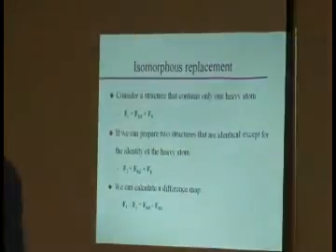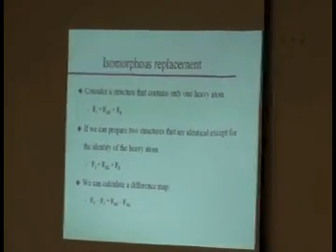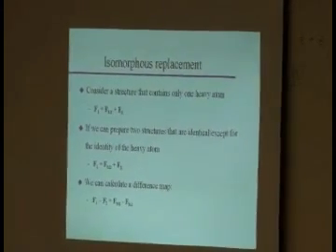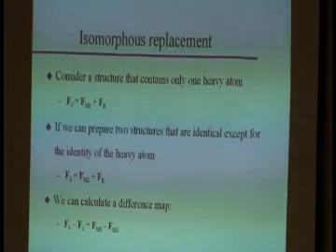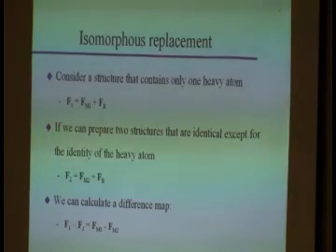All right. Now, Patterson maps are still in use nowadays. Most computer programs for single crystals actually have Patterson implemented as one of your options for solving things. But you can't always do that, okay? Sometimes you have to do other things. And the rest of this lecture will introduce some of those other things. What else can you do to get initial phases for some reflections in your structure?